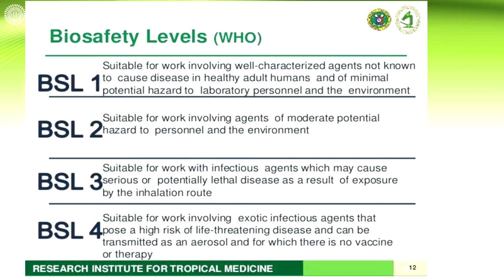Biosafety level 2 naman, it means that you are working with agents that can cause potential hazard to personnel in the environment. So, tandaan nyo lang kapag biosafety level 1, ang microorganism dito are those under the risk group 1. Kapag biosafety level 2, those are under the risk group 2 microorganism. For the biosafety level 3 naman, yes, infectious agent yan, under the risk group 3. They may cause serious or potential lethal disease as a result to exposure by the inhalation route. So, yung mga microorganism that you can get through inhalation, under siya ng biosafety level 3.